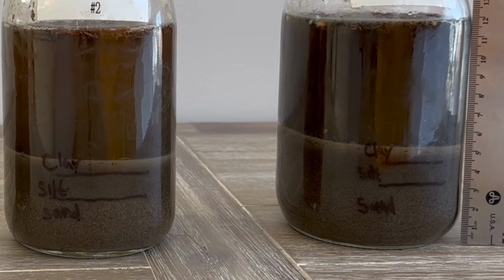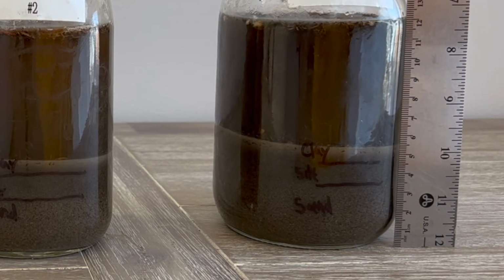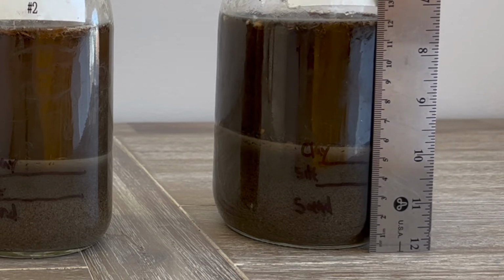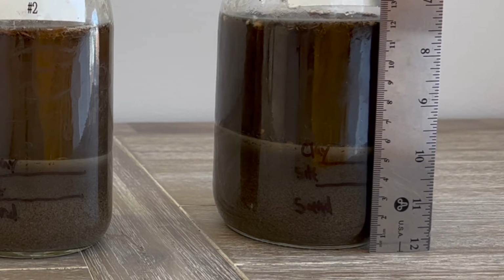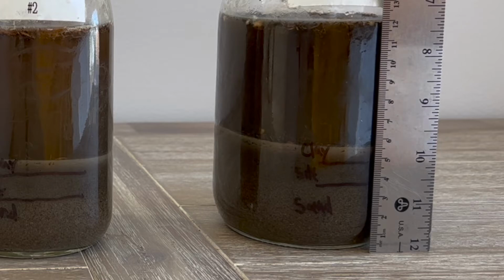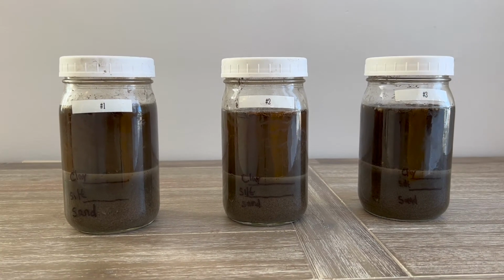And then moving on to the third one, we've got a total of right about 55 millimeters. The sand comes to 37 millimeters, the silt we have about 11 millimeters, and the clay is about 7 millimeters.